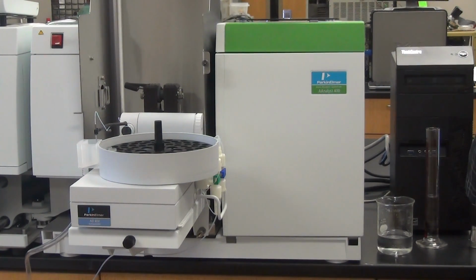So it allows the sample to have just enough lag so that the gases above the sample are relatively near the temperature of the vaporized sample, so that you don't go from a hot environment to a relatively cool one.